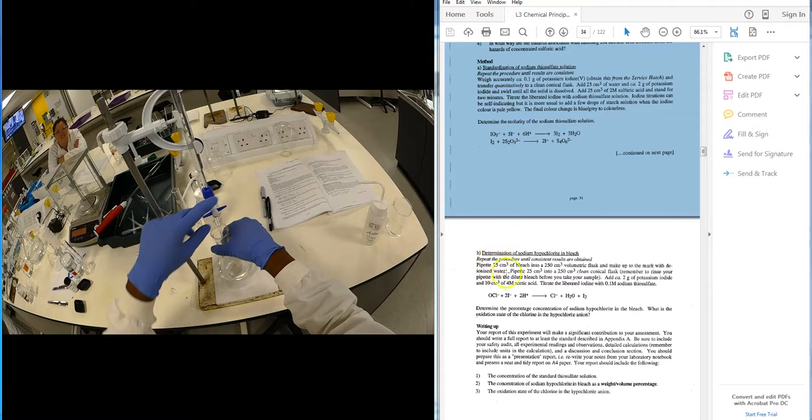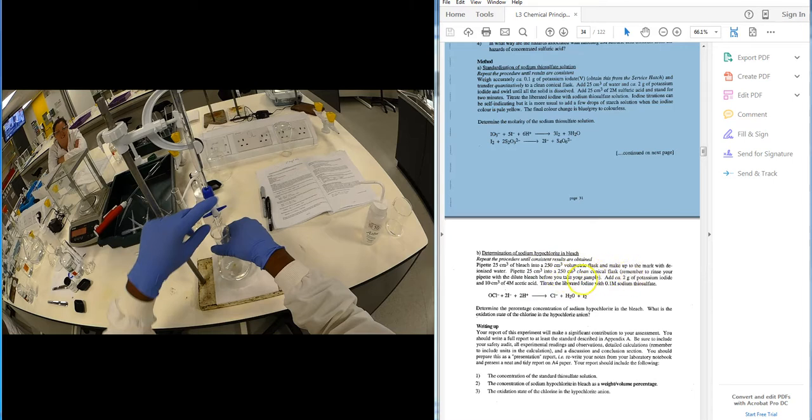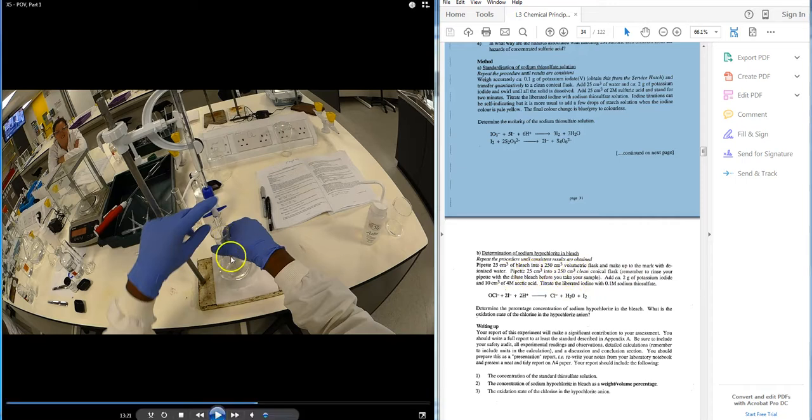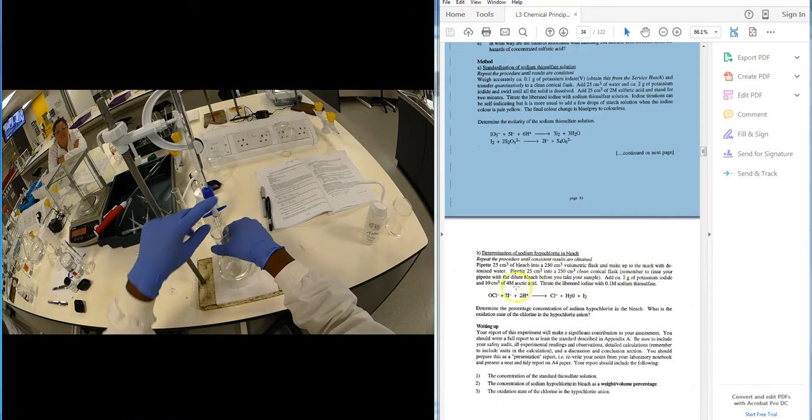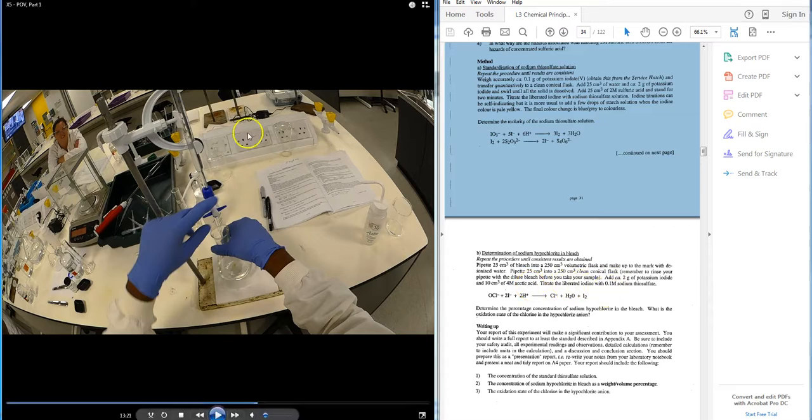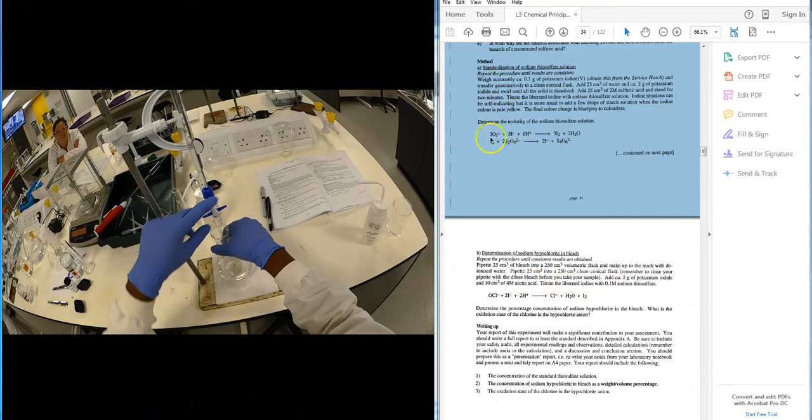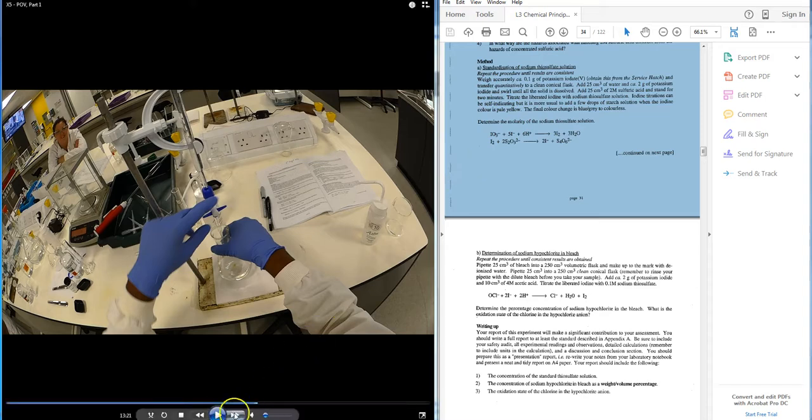But the student then should do two concordant results within 0.1 ml of each other and leave part A alone. And what we see here, the student then needs to pipette 25 ml of bleach into a 250 ml volumetric flask, make up to the mark, and then with a clean prepared transfer pipette 25 ml aliquots into the conical flask, again add the iodide and this time some acetic acid and titrate this with the 0.1 molar sodium thiosulfate that you standardized at this point.